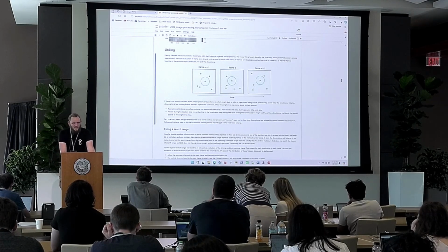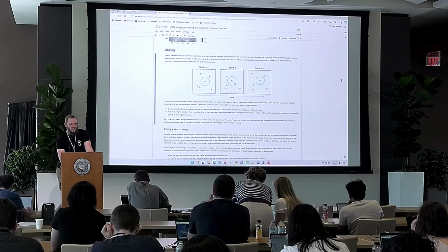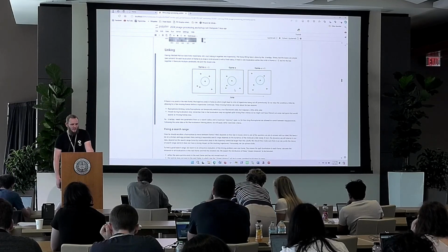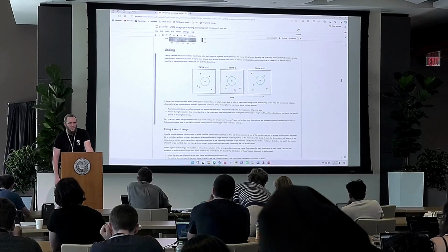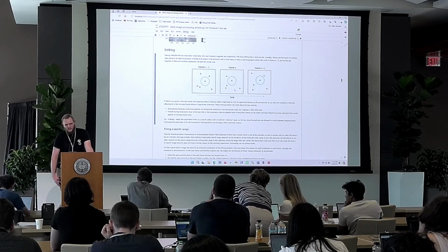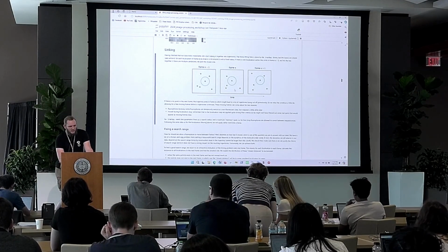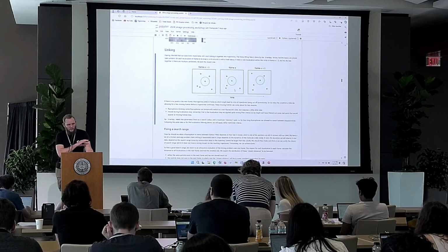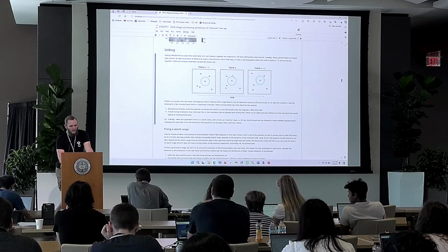Of course, that's not always going to be the case. Sometimes you find multiple particles in this linking cutoff, and then you have to make some decision which one to choose. There are a bunch of different algorithms to do this. The simplest thing you can do is just take the closest one. If you have a lot of these events in your data, that's going to introduce some bias, so you have to be careful about it. In the example data we have here, labeling is sparse enough and the loci move slowly enough that we don't really have this issue, which is quite convenient.